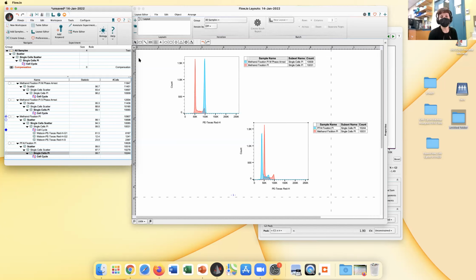Yes, absolutely. Also, in cancer, what we can sometimes see is aneuploid populations, so cells that have not the normal diploid or tetraploid amount of DNA. But we do have some limitations with flow cytometry. We can't pick up single translocations, for example. It's not going to change the DNA content, but it is a very useful technique. I say I've been doing this for nearly 40 years, so it's kept me going.